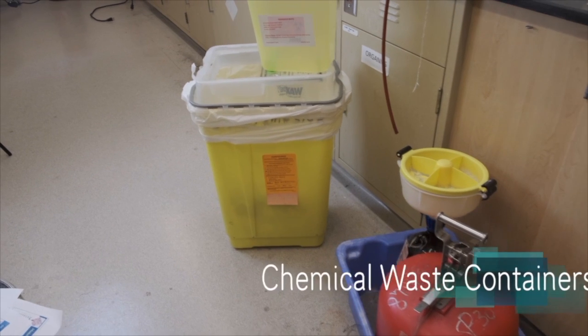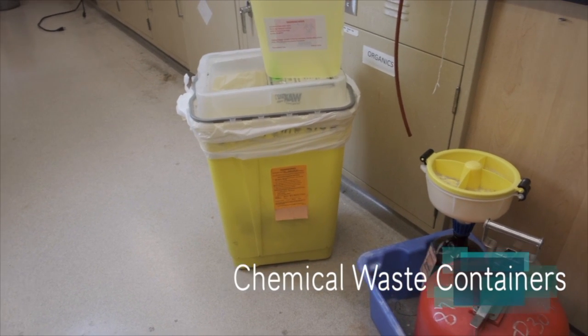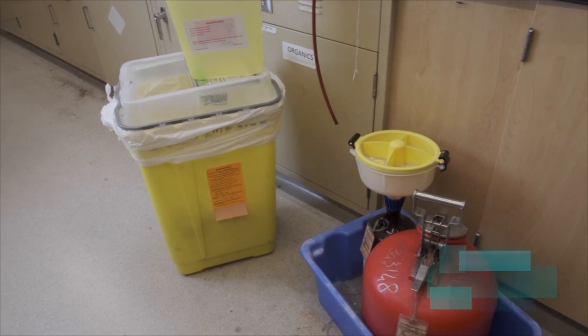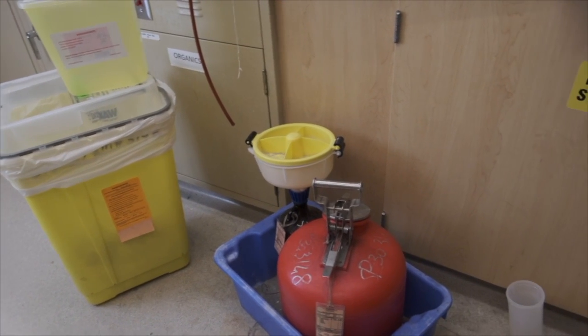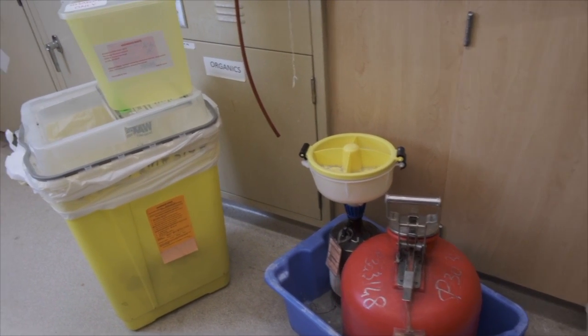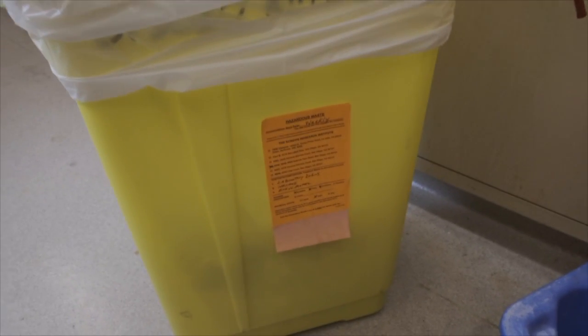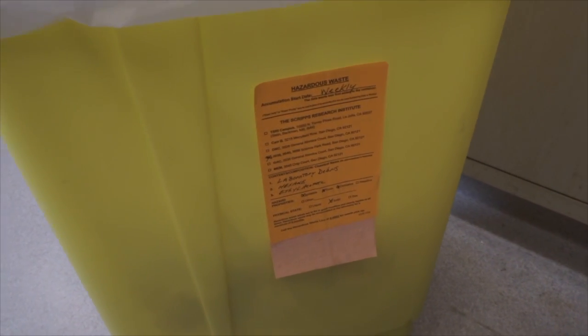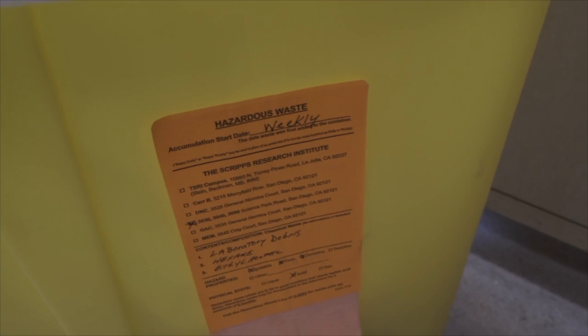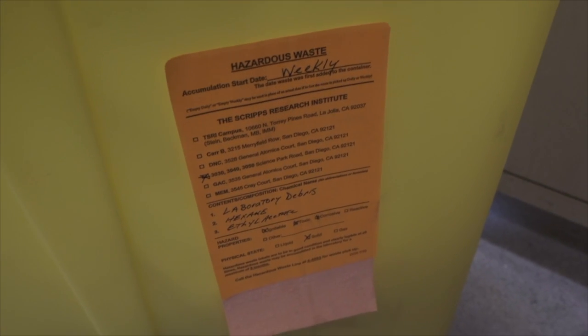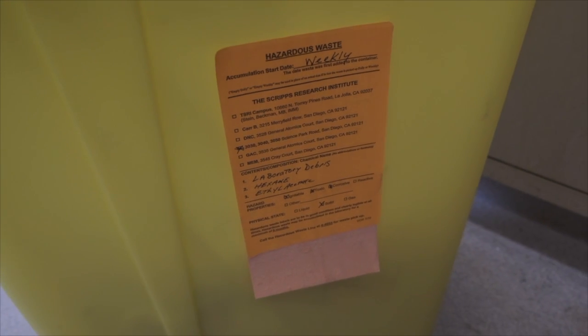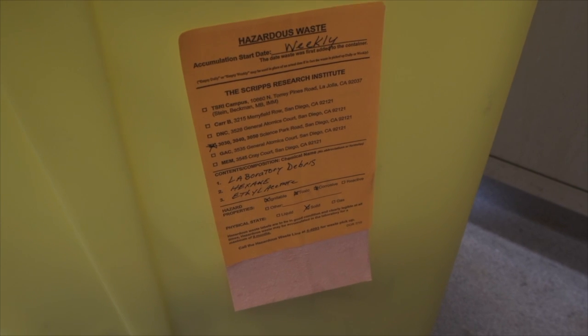Here are some examples of common chemical waste containers that you'll see in the lab. Some things to remember about waste accumulation is that you want to have a hazardous waste label on every chemical waste container, such as this one. Make sure that you fill out all the information on the label, especially the accumulation start date. This is the date that you first add waste into the container.